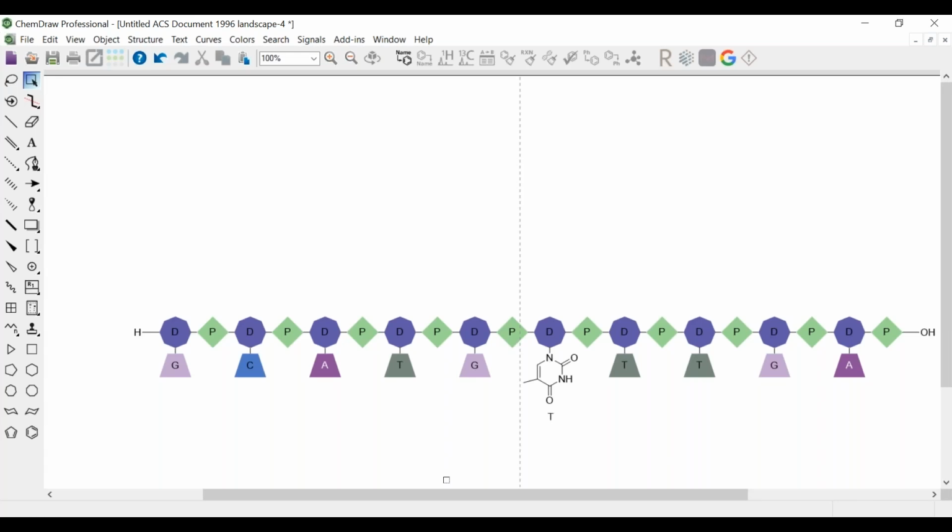So we're moving through really quickly here. A lot of different ways for you. Again, I really haven't touched this toolbar at all, but I've generated a lot of very interesting chemical content here for people to consume. So we continue to add these different ways to use chemical intelligence in ChemDraw to allow you to put chemical content in here that's meaningful to folks, but it just makes your life a lot easier. You wouldn't want to have to draw even this very short oligonucleotide. You wouldn't want to have to draw this manually, and now you don't have to.